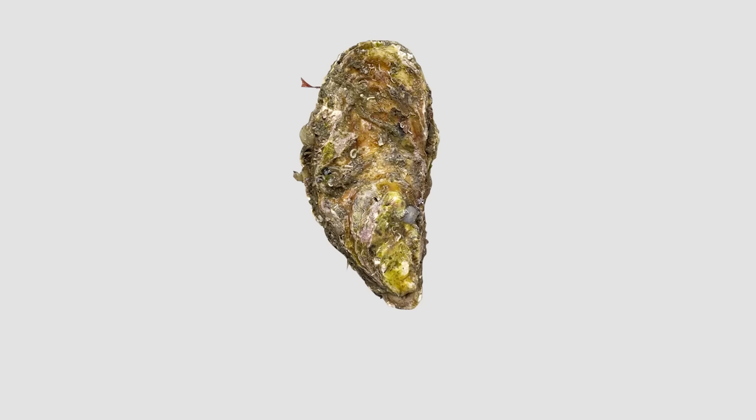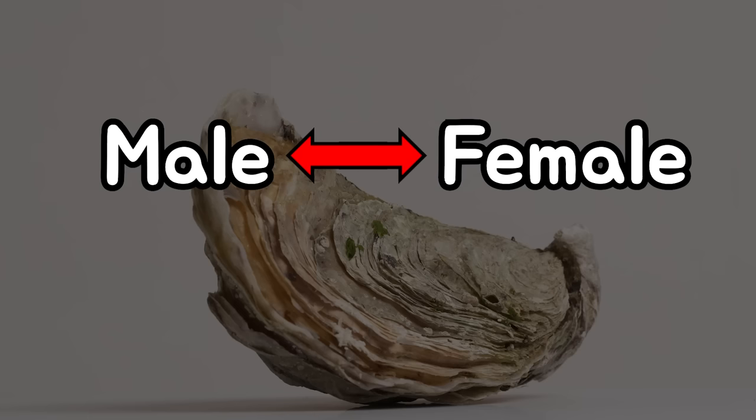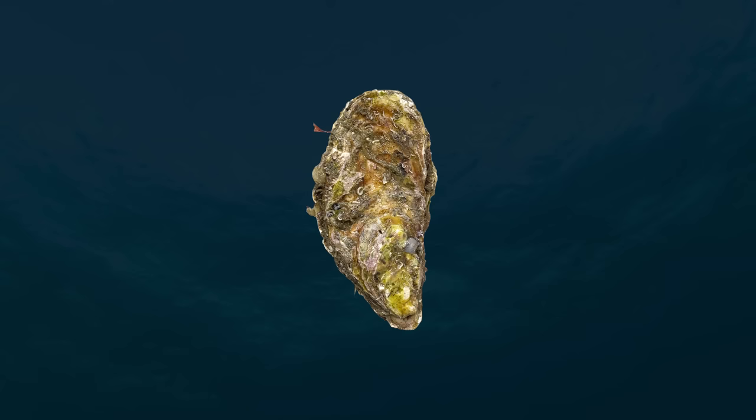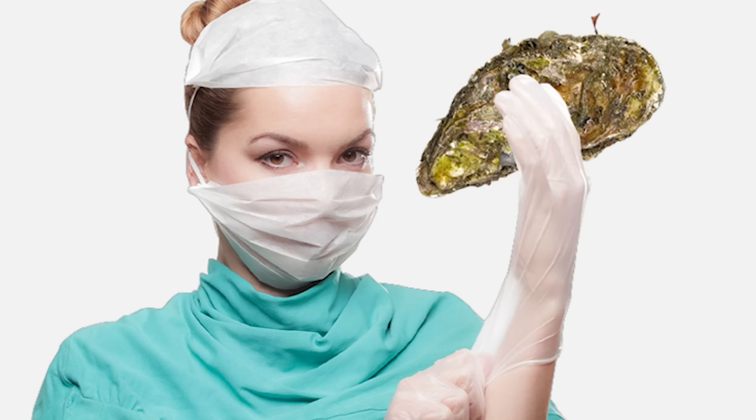Finally, oysters are unique in their reproductive methods. Oysters are sequential hermaphrodites, in which males and females are produced alternately during the reproduction period. It has a transsexual process, producing sperm and eggs alternately. Most male gonads in oysters tend to mature first, but they also change from female to male depending on the environment. Amazing, right? This is the end of the oyster's anatomy.